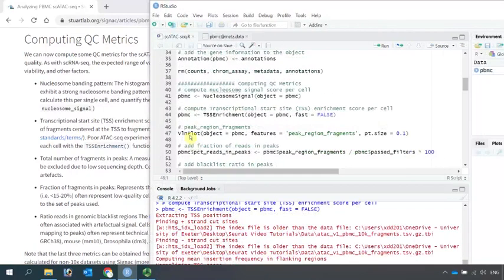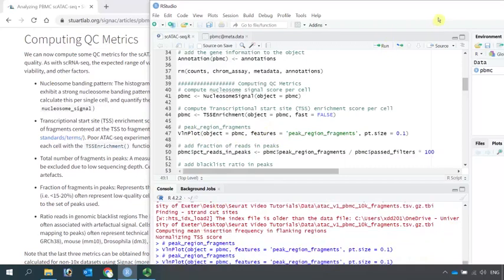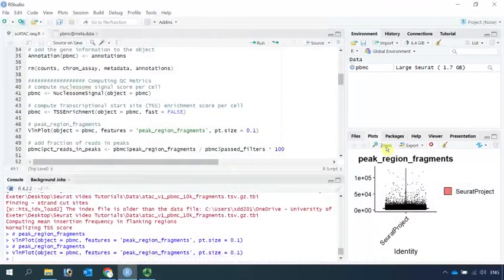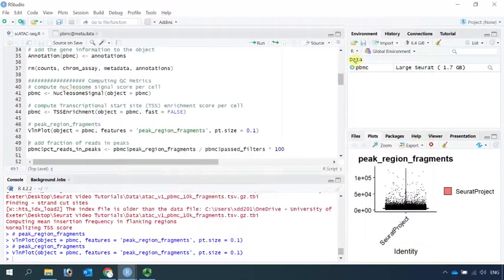The metrics data for the peak region fragments is in the data already, so we don't need to calculate it. We can use the violin plot function to have a look at the peak region fragments. Let's zoom in. You can see we have the metrics data for peak region fragments.